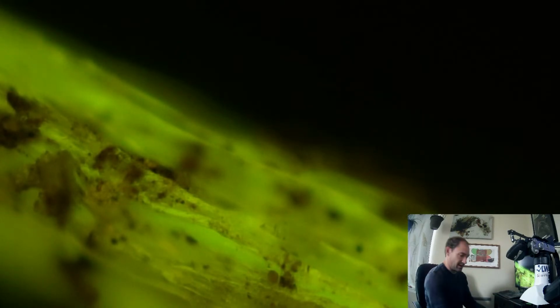So tough. Wish half the chat wasn't covering my screen here. Oh well, let's move it over just a little bit there. There we go.